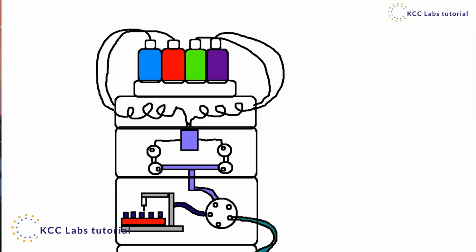and it will be in maybe 4-liter solvent bottles. It might be in a 1-liter plastic container. Again, most of the time you're going to see multiple containers because many HPLC techniques use what's called a gradient solvent system, where you're changing it over time and either increasing or decreasing the polarity at certain time markings on the column.